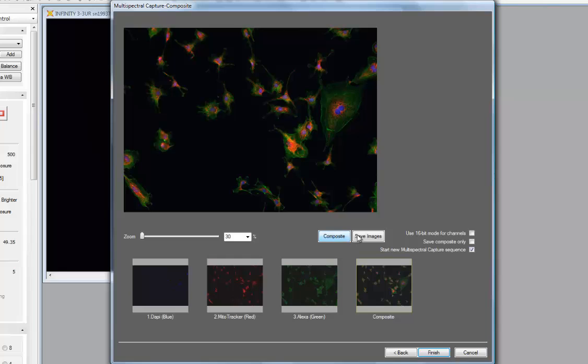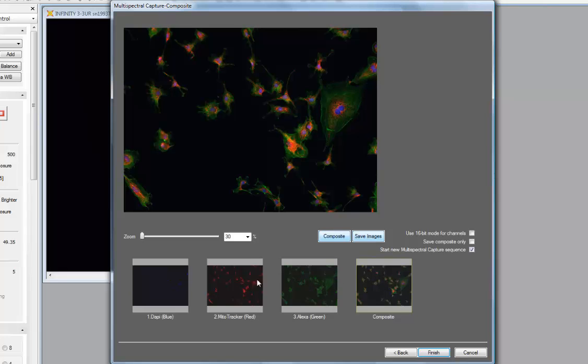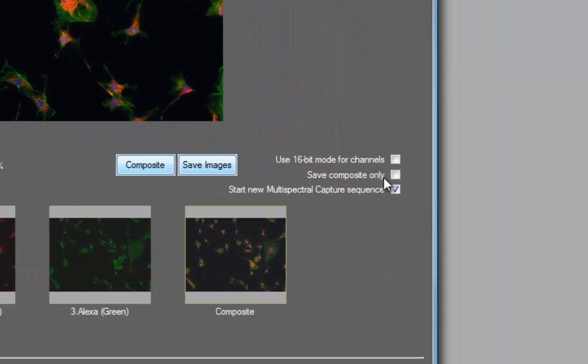At this point, my next logical step would be to save images. If I click on this button, a save dialog will appear, giving me a choice of file name and file type to use to save the composite image and the individual channels that made up that composite, if desired. If I click this option here, save composite only, then only the composite will be saved, and my individual channels would not.